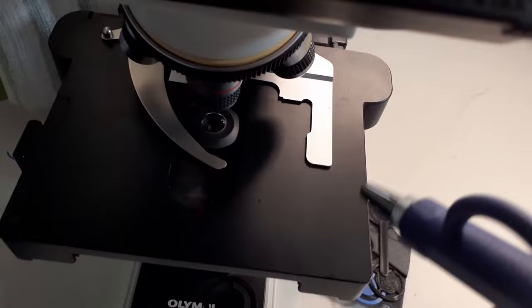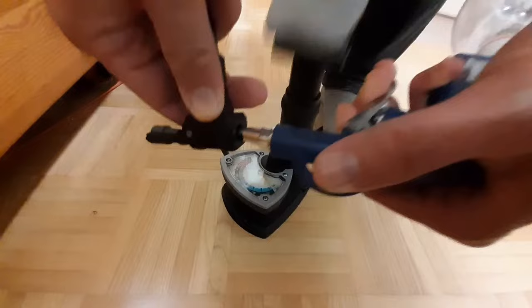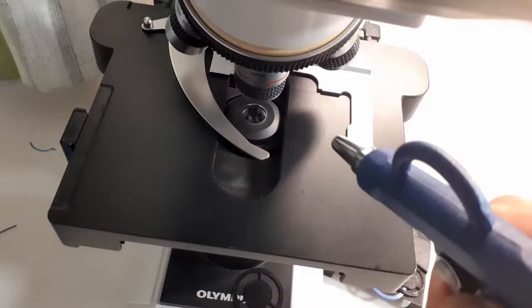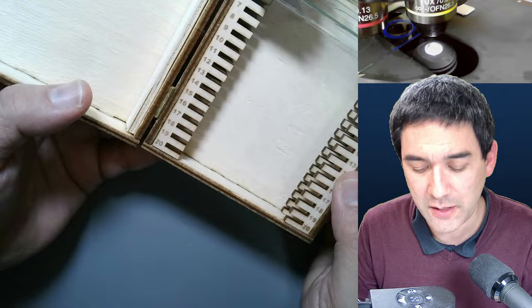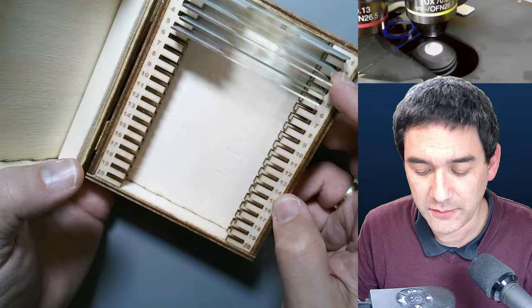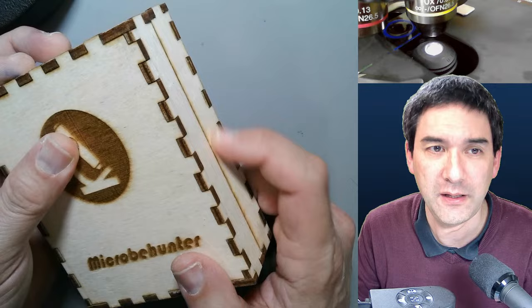There's another self-made box I want to show you. Because I have a laser cutter, I designed and cut this wooden box for slides. There's definitely no deformation issue with wood. I put some hinges in, but haven't found a suitable lock yet. I just wanted to share this with you.